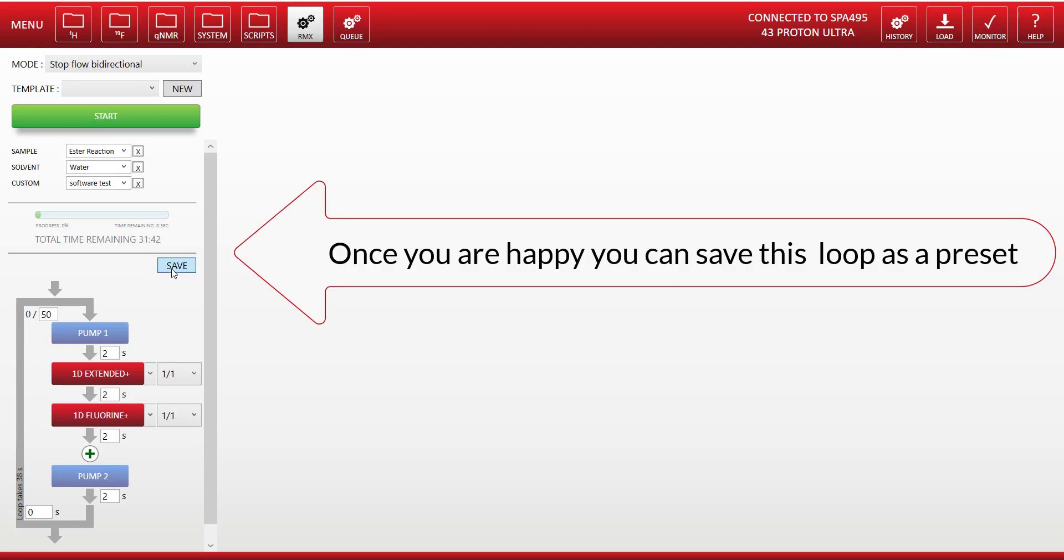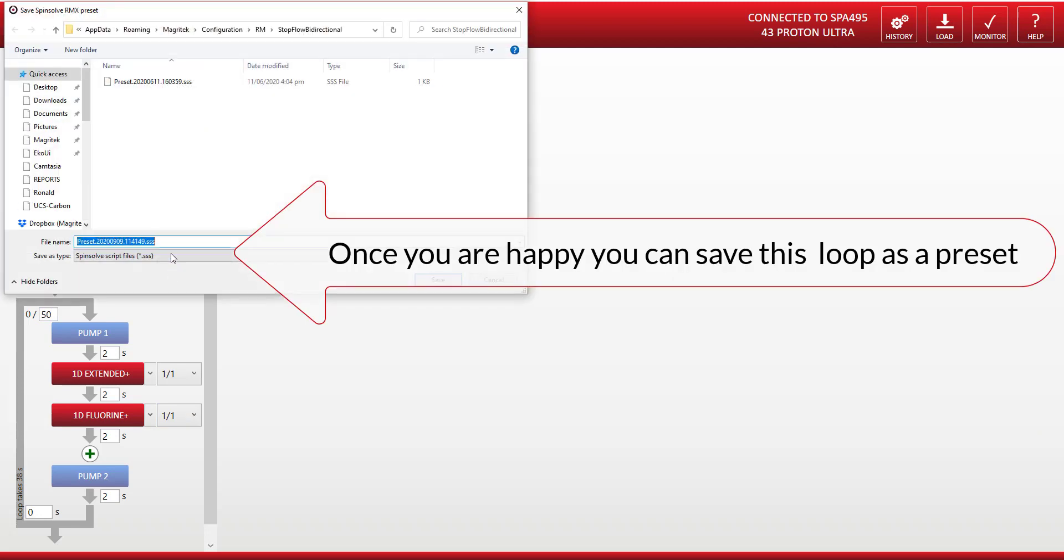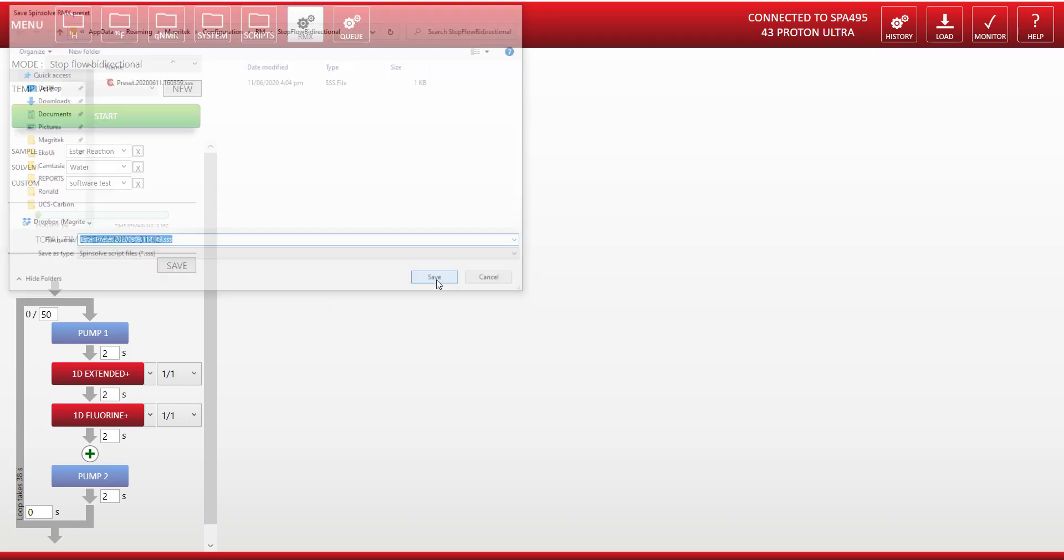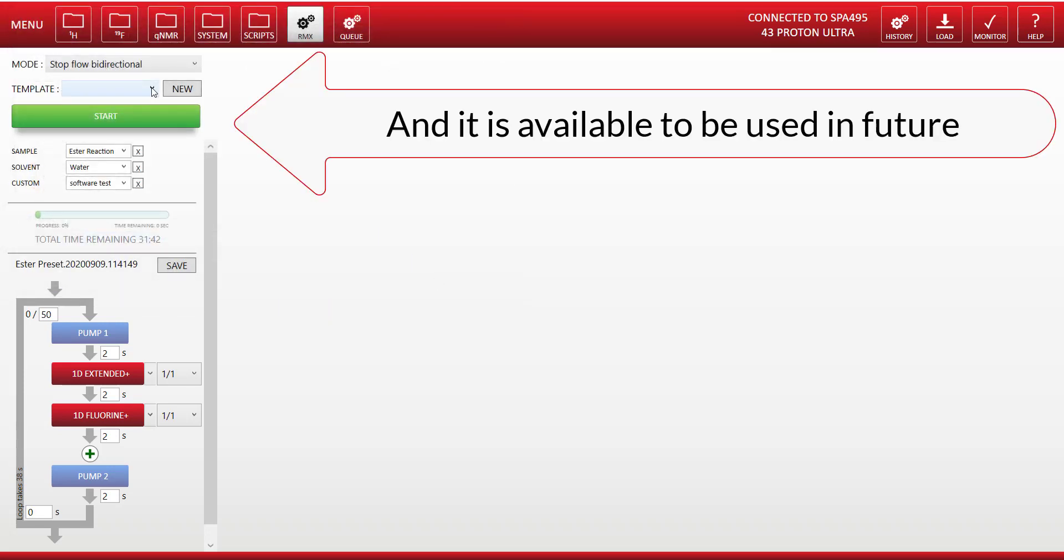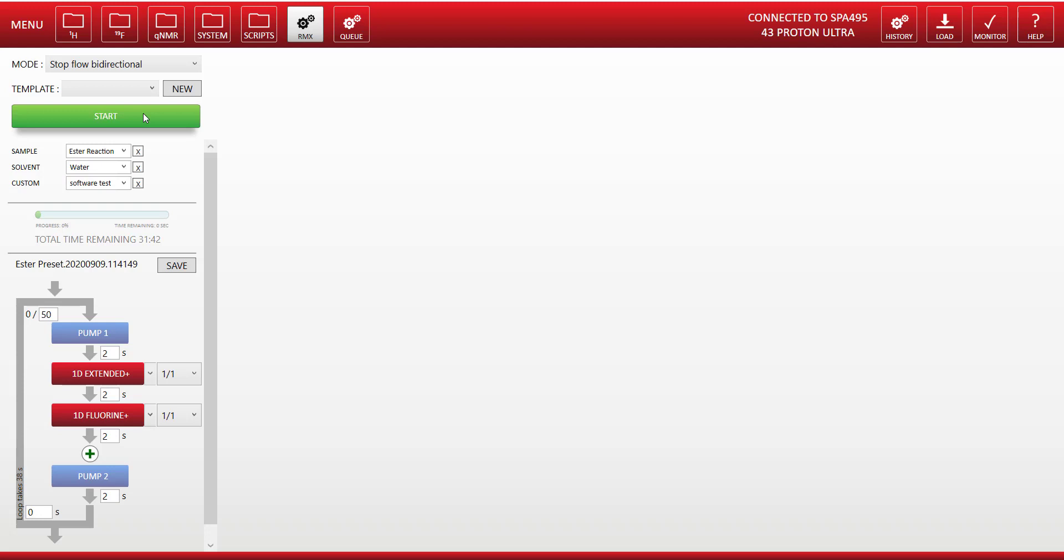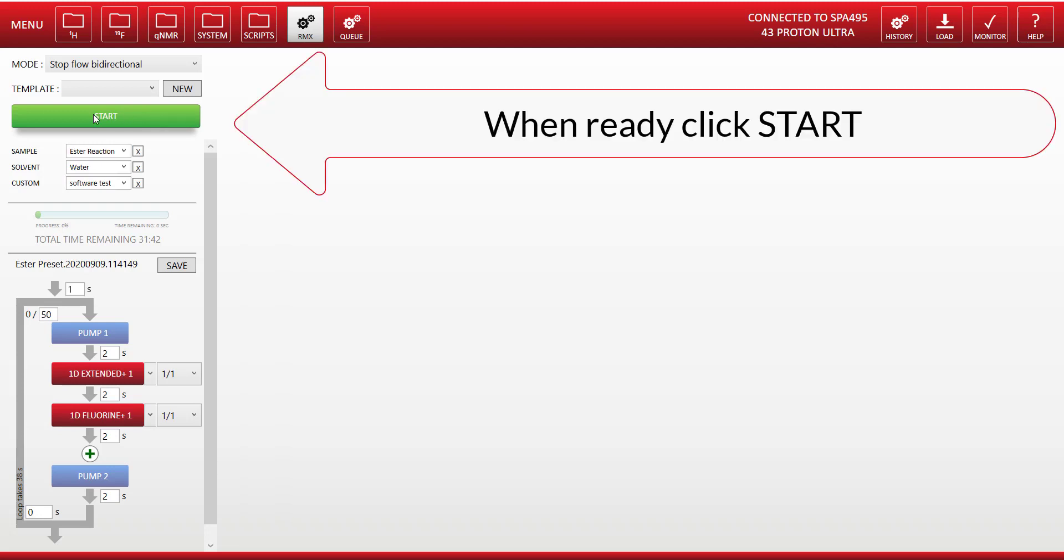And once we've got it the way we want it we can save it as a preset, and that preset will be available to us again in the future. Now these parameters can all be changed once we've started so we have a lot of flexibility. Now when we're ready we click start.